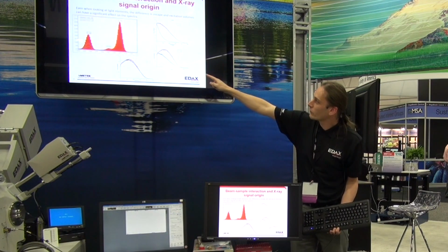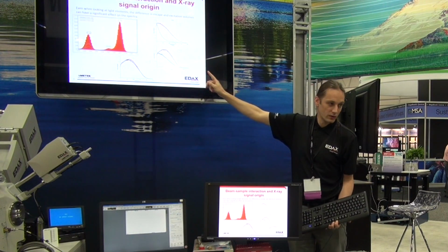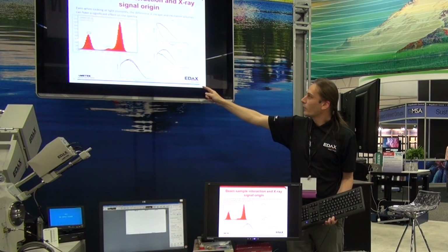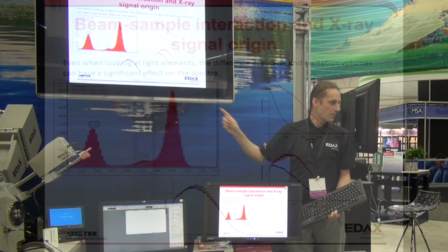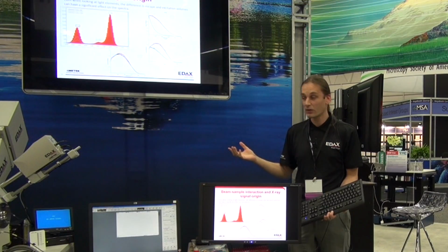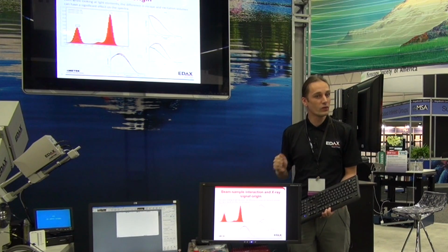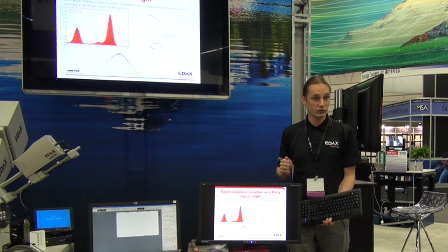If you look at these spectra, I've been talking about the fluorine and carbon peak. The red one is the 5 kV one, and we can see we now have a slight oxygen bump. Because we're getting more surface sensitive, we start to see that's actually oxygen on the surface. It's not in the matrix because it's drowned out when we have a large probe depth, but there's a slight surface oxidation or some oxygen bound in other ways on this Teflon sample. So that's one of the reasons why you would want to go to low kV.